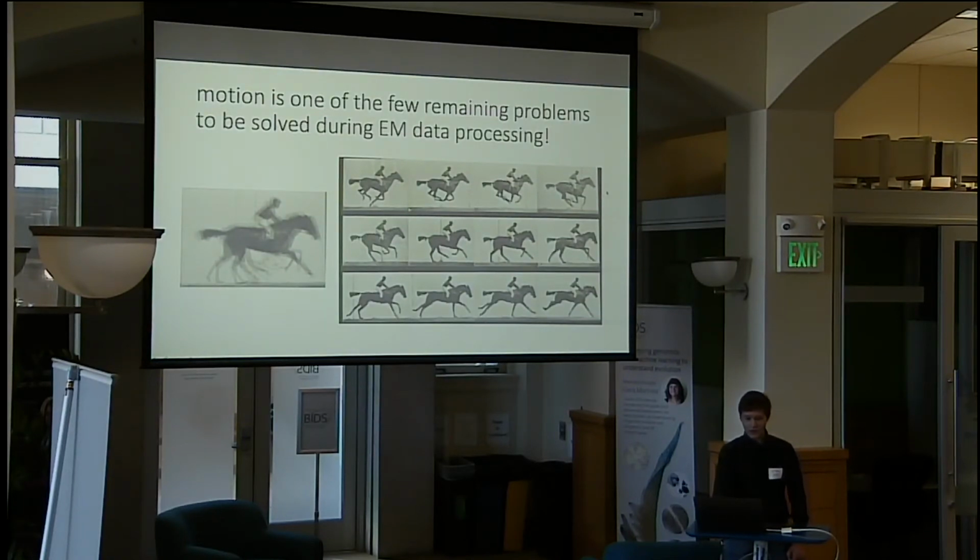And so if you were to get this averaged image, which is analogous to what we would get by standard single particle volume reconstruction approaches, it's not immediately obvious whether the horse is completely off the ground at any given point. And if we were going to analyze this the way we would analyze single particle images, we would look at the body makes this mostly stable region here. Maybe there's something going on with the head. And there look like there are a couple of leg domains, but they're disordered. They're clearly not functionally relevant.